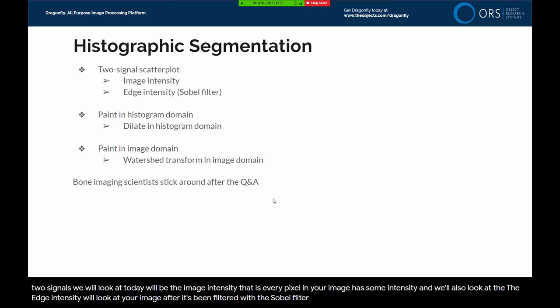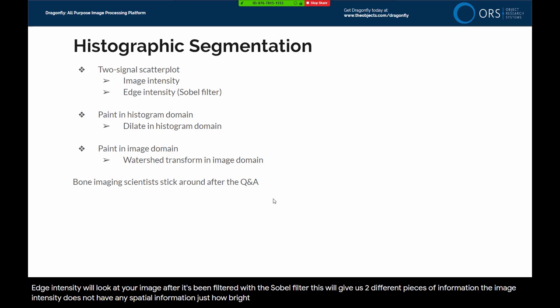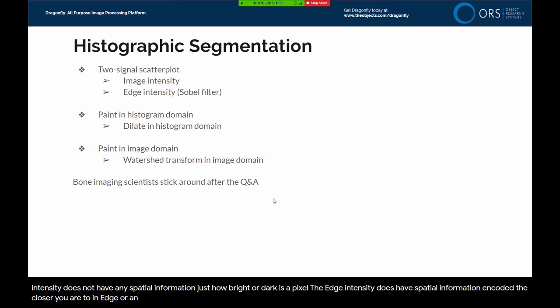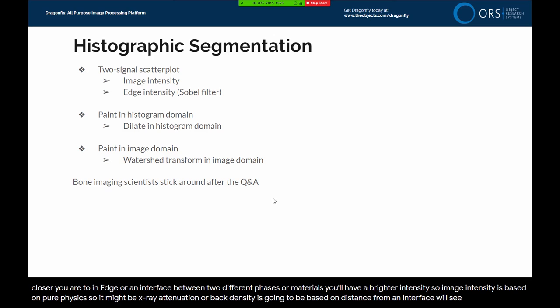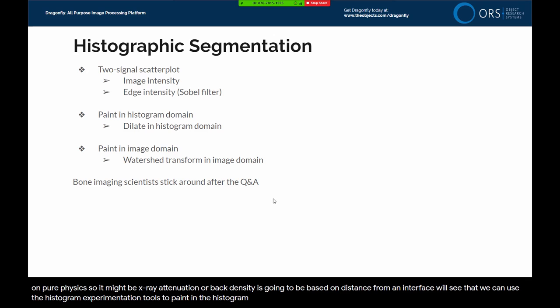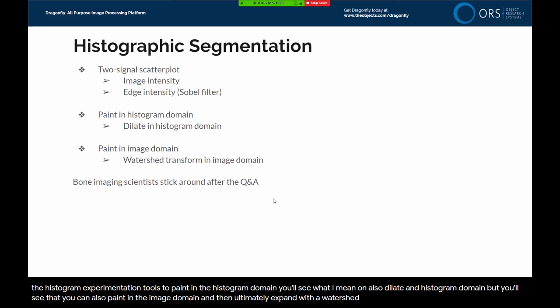The image intensity has no spatial information — just how bright or dark a pixel is. The edge intensity does have spatial information encoded: the closer you are to an edge or interface between two different phases or materials, the brighter the intensity. So image intensity is based on pure physics — X-ray attenuation or backscatter — whereas edge intensity is based on distance from an interface. We can use histographic segmentation tools to paint in the histogram domain and also dilate in the histogram domain, or paint in the image domain and then expand using a watershed transform.